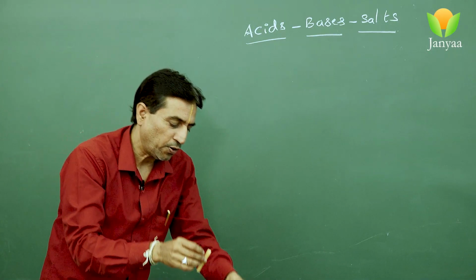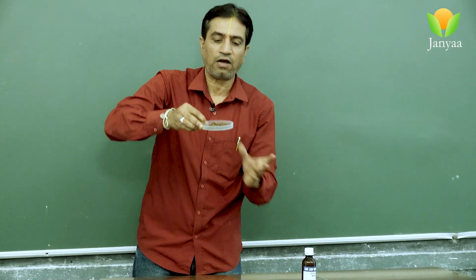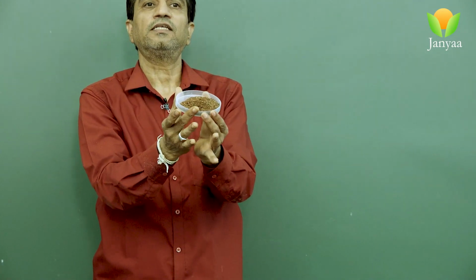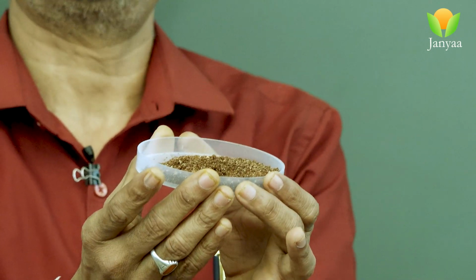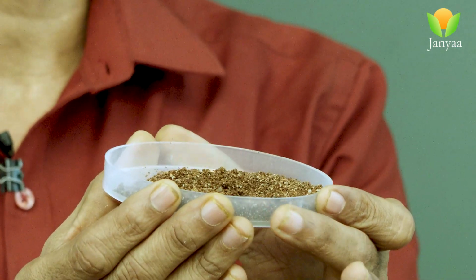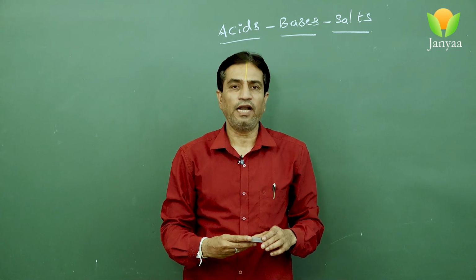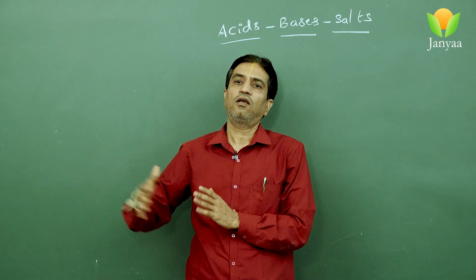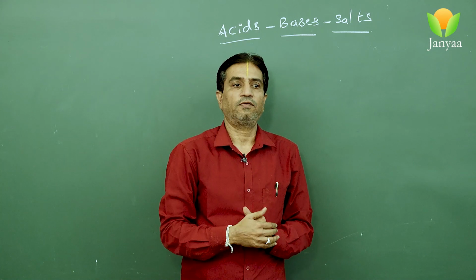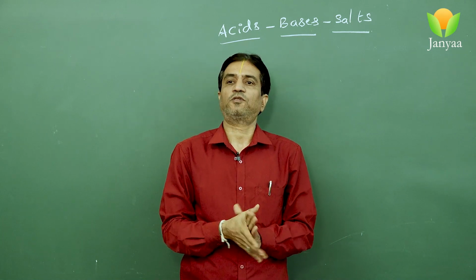Yes, it is neutral. We collected the soil from our school ground. The pH value of this soil is 7, which means it is a neutral soil. In this type of soil the plants and crops will grow and the yielding will be good, and the farmers get benefited when planting trees as well as crops.